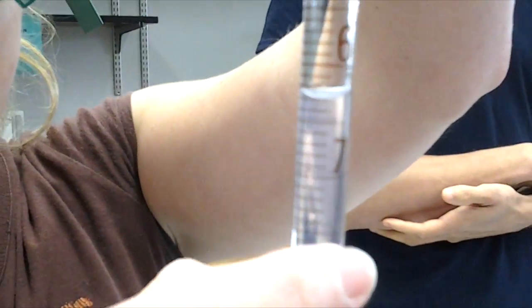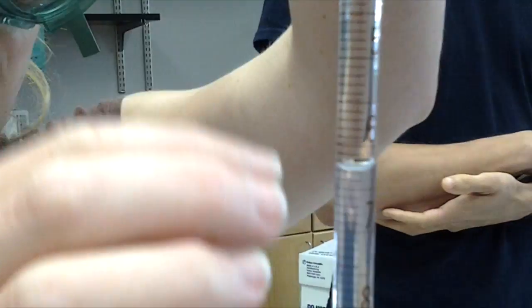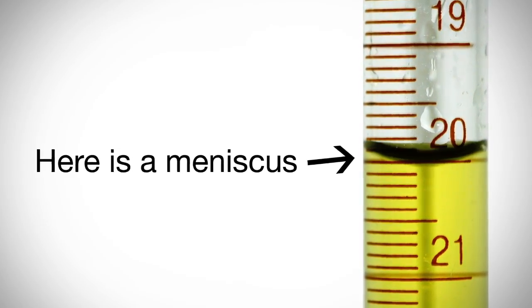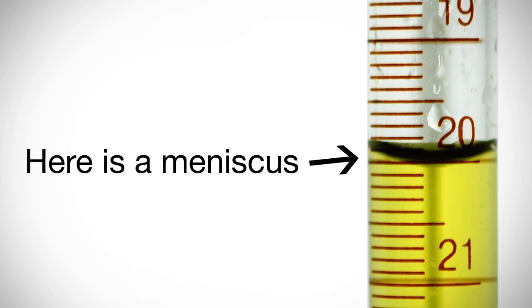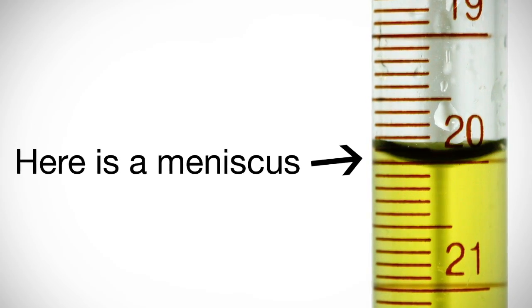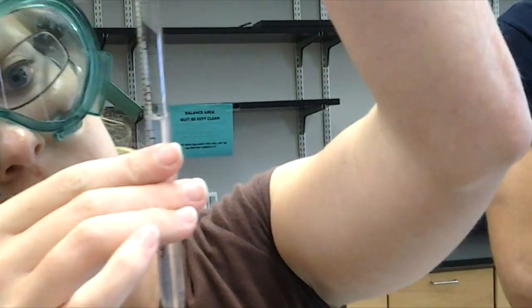The curved shape at the surface of the aqueous solution is called a meniscus. Solutions with water form a meniscus in the pipette because water is polar, or composed of positive and negative ions, known as cations and anions, respectively. Likewise, the glass of the pipette is also polar. The glass's ions attract the water's ions of opposing charges, pulling them slightly up the walls of the pipette and creating the meniscus.